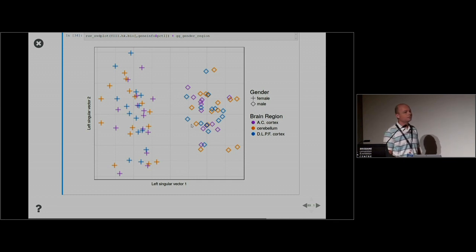Okay? So again, the high-level and very important point is that, one, in any analysis, it's really in some sense up to you what should be considered wanted and what should be considered unwanted. And also that these RUV methods give you a way of addressing that in a somewhat natural way, by what you consider to be negative controls and what you consider to be replicates.